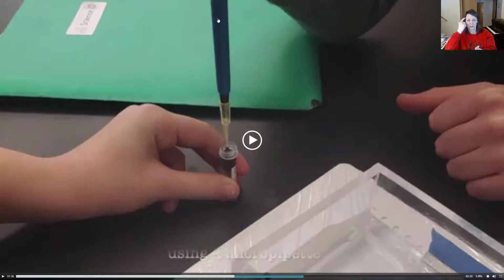We will show you in class that there are actually 2 levels of pressing that button. The first level is what you are going to do when you go down into the ink container. Then you release. That's going to suck the ink up into the tip.